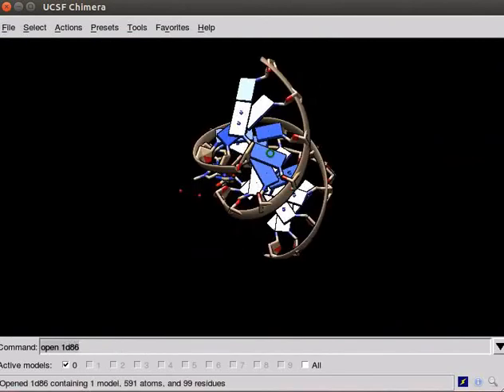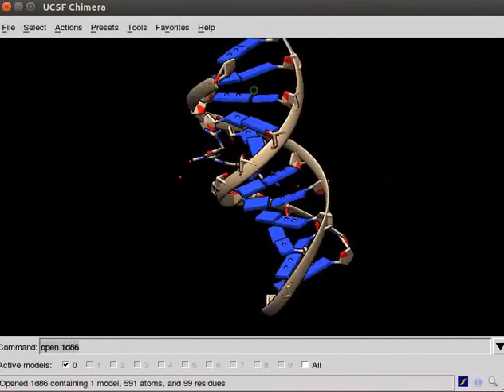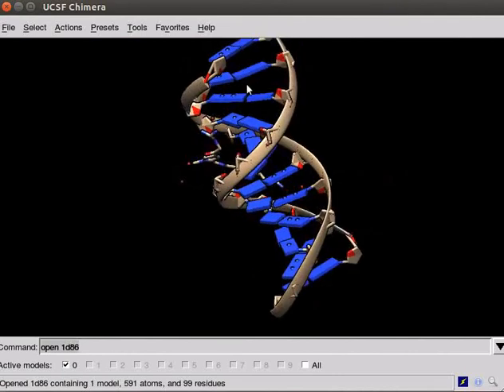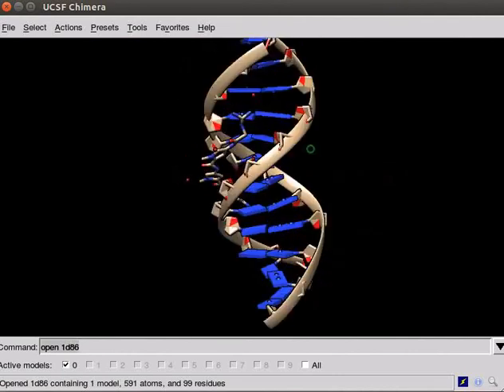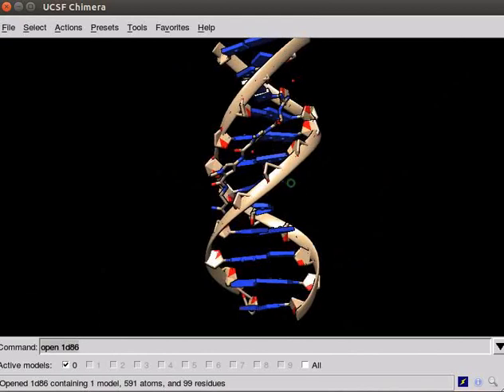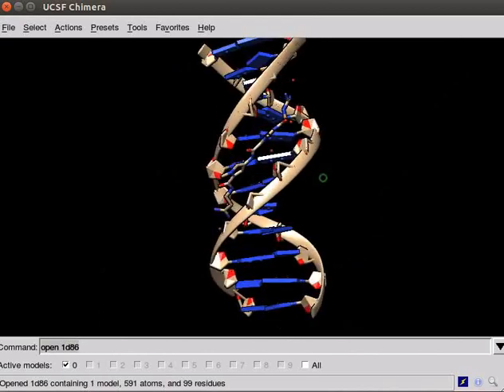Open the Graphics window. Fetch the structure of a DNA using command line. On the command line text box, type Open 1D86. Press Enter. The structure is of a double helical DNA with a molecule of Netropsin bound to it. Netropsin is a polyamide with antibiotic and antiviral properties.